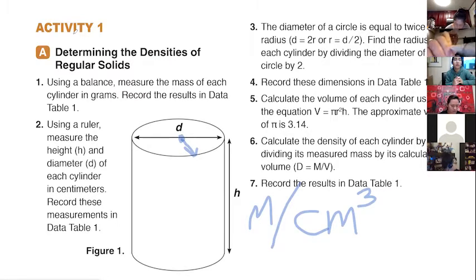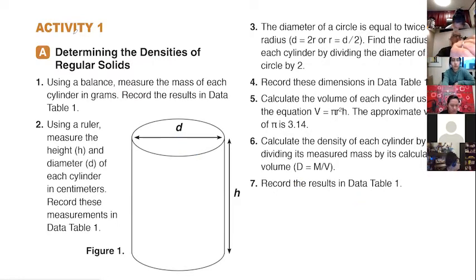that's pretty good. One thing I want to point out when we're doing our measurements, you remember I've been harping on and on about when you make a measurement, the last digit of your measurement is an estimate by you. That will especially be the case here, because when we're doing this measurement, you can see that when we line up, when we're trying to get that measurement correct, it may not line up exactly on one of the lines.